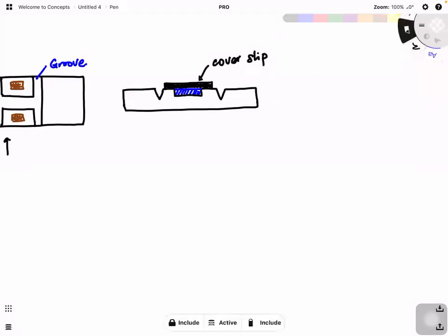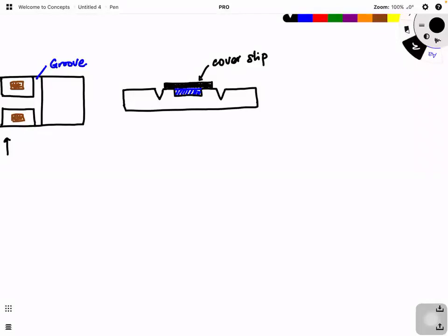So what is the function here is, we do know the thickness of this well. Are you clear? The depth of this well. The depth of this well generally is 0.1 mm, or equivalent to 1 × 10⁻² cm. Okay, I will tell you why I changed to cm.